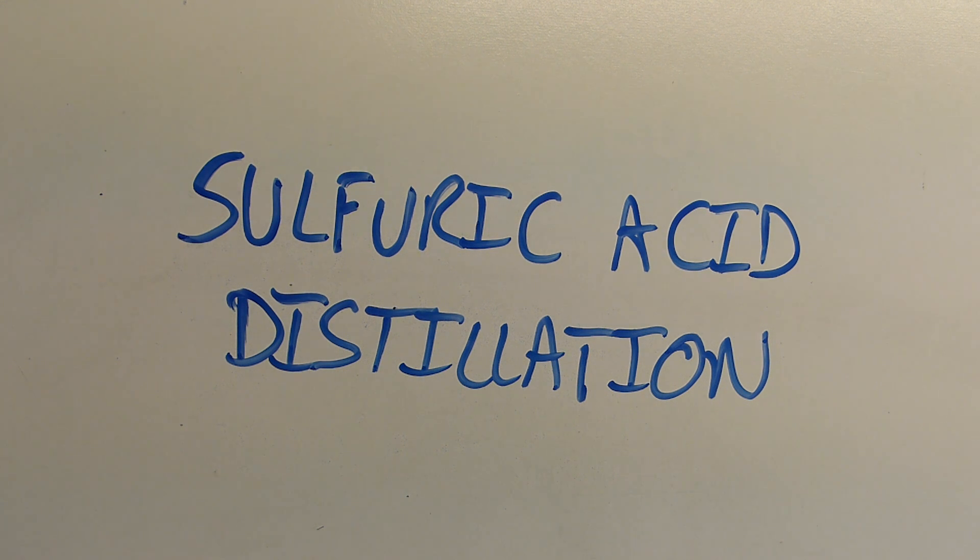So today I'll be doing a sulfuric acid distillation. There really isn't much to say about the sulfuric acid distillation other than that it's a bit tricky because the boiling point of the azeotropic sulfuric acid that we will be distilling is 337 degrees Celsius, which is very hot.